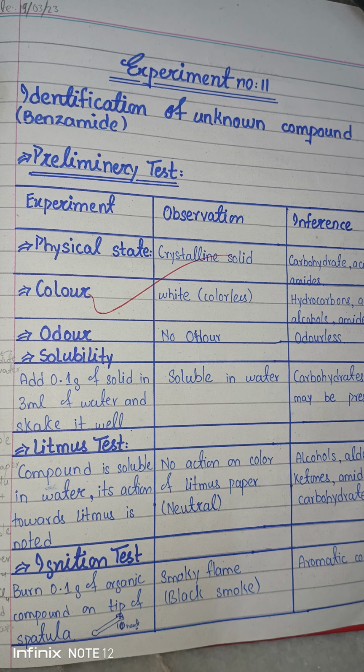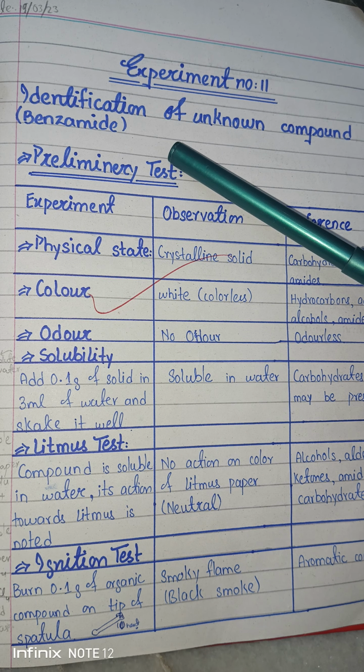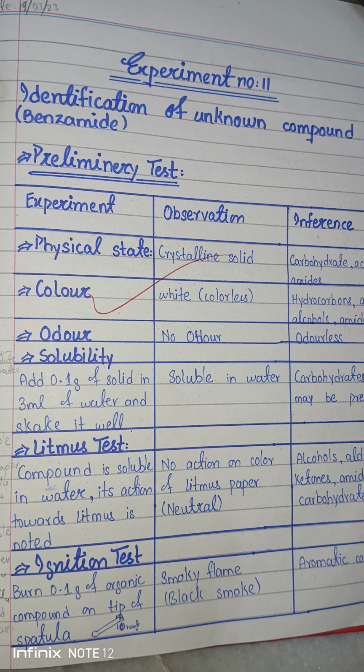In today's video, we are going to discuss another important experiment of organic chemistry, and this experiment is about identification of an unknown compound, and this compound is indicated as benzamide. In the previous lecture, we discussed benzoic acid, and we covered all the tests which are performed on the benzoic acid, and all the requirements we have studied.